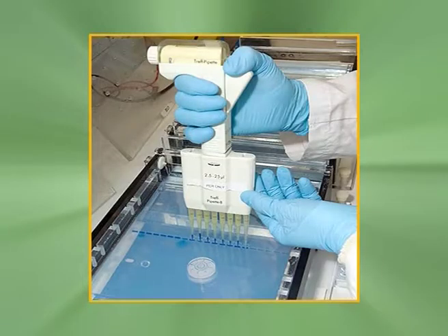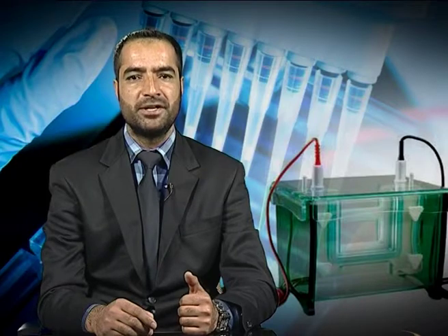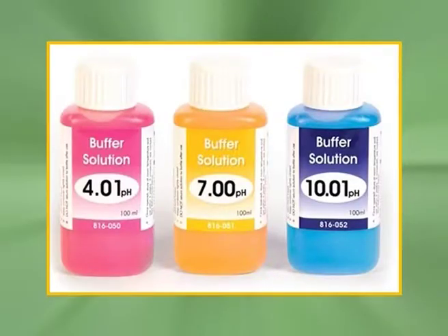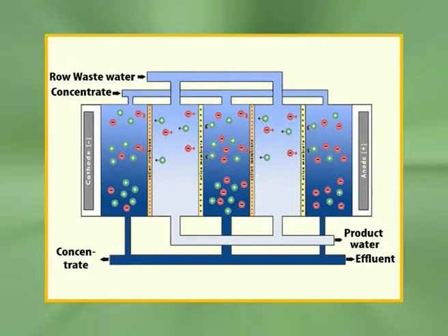An electrophoretic separation is performed by injecting a small band of the sample into an aqueous buffer solution contained in a narrow tube, a flat porous support medium such as paper, or a semi-solid gel. The high voltage is applied across the length of the buffer by means of a pair of electrodes located at each end. This field causes ions of the sample to migrate towards the oppositely charged electrodes.